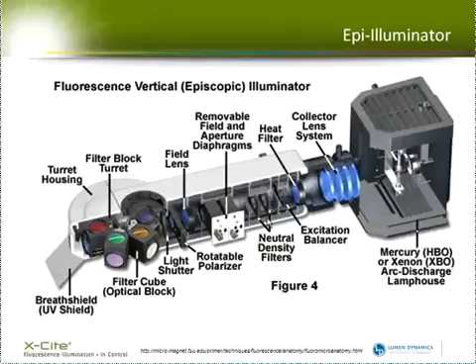There's often neutral density filters, and what these do is they neutralize the light across the whole spectrum. So the heat filter will specifically filter out infrared light, whereas the neutral density filters will just reduce the light completely. They're almost like having a pair of sunglasses where you just put them on to reduce the total light that's getting to the eye.